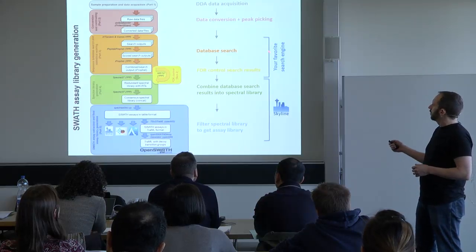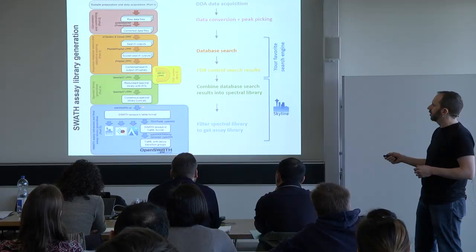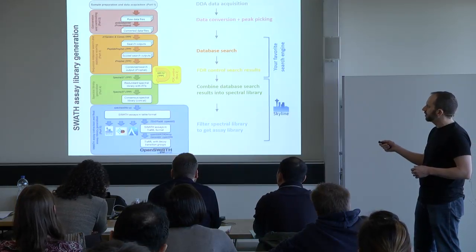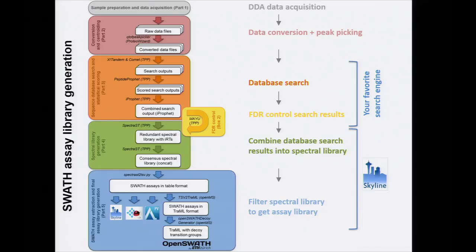And so, yeah, I want to point out that this might look a bit overcomplicated or very detailed, and it certainly is many different tools, and you would have to become familiar with all of these, but it's all written down in the protocol how to do this. But I just want to point out that there is certainly a much easier and faster way to do this, and you can use your favorite search engine, whatever you're using now for this part, right?